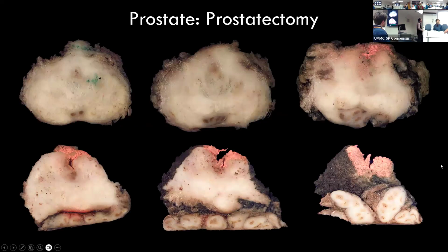So in all these sections, these are serial slices of the same specimen. And you can see, this is the apical, like mid portion of the prostate, where the seminal vesicles have become ejaculatory ducts, and they are right in the middle of the prostatic stroma. Here you can see it's starting to separate out into vas deferens and seminal vesicle, and there's also a small separation. Here, part of it is starting to separate out from the prostatic stroma, but part of it is part of the prostatic stroma. In this section, it almost separated out completely, but you still see some attachment here to the prostatic stroma.